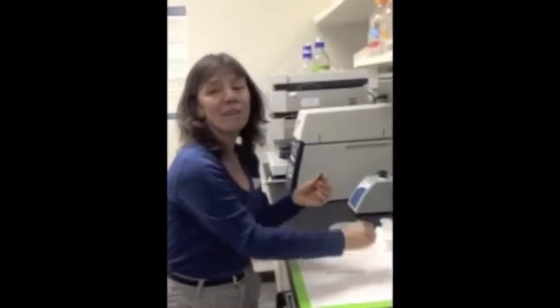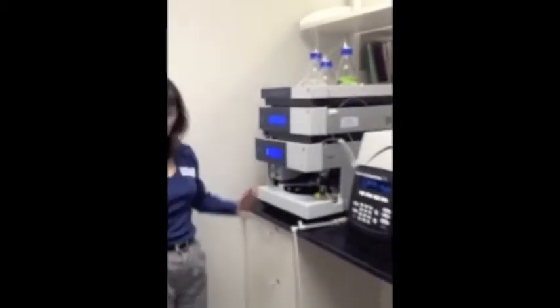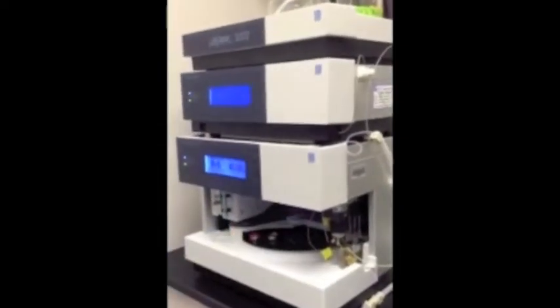So now I'm just taking this tiny sample and loading it up into this vial, because the nice thing about this technique is that it's all automated. Things have really changed a lot since I was a graduate student, and I had to do a lot of this by hand. But as you can see, we now have very shiny, nice new equipment that helps us do this. So this is an auto sampler. I can take the samples and load them up in here, just like that.